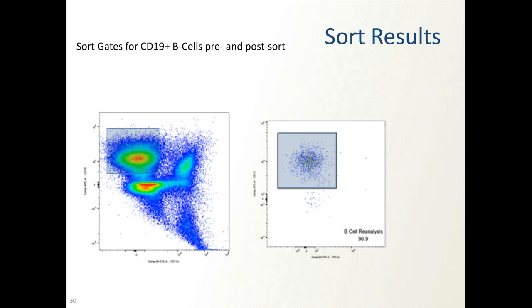When we look at the B cells, sure enough, they all sorted as B cells. And when you look at the sort, it's 96%. These are probably cells that died in the waiting, and this is probably the few represented impurities or maybe a little bit of passaging or something. But this sort worked. We're not seeing unusual distributions here to suggest that the delays weren't working right.